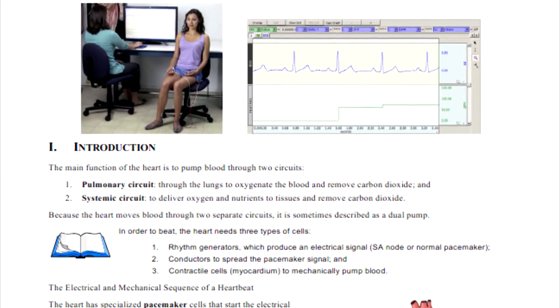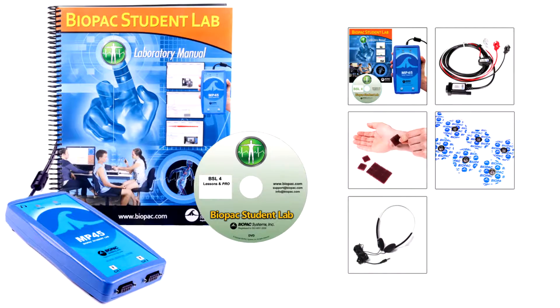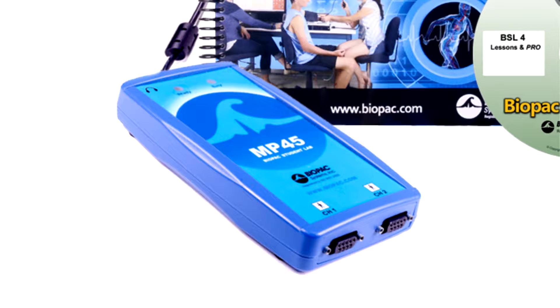The BSL intro system includes six guided lessons and allows open-ended recording for student-designed experiments. The following equipment and materials are included with the system. The MP45 data acquisition unit is the core of the two-channel systems.